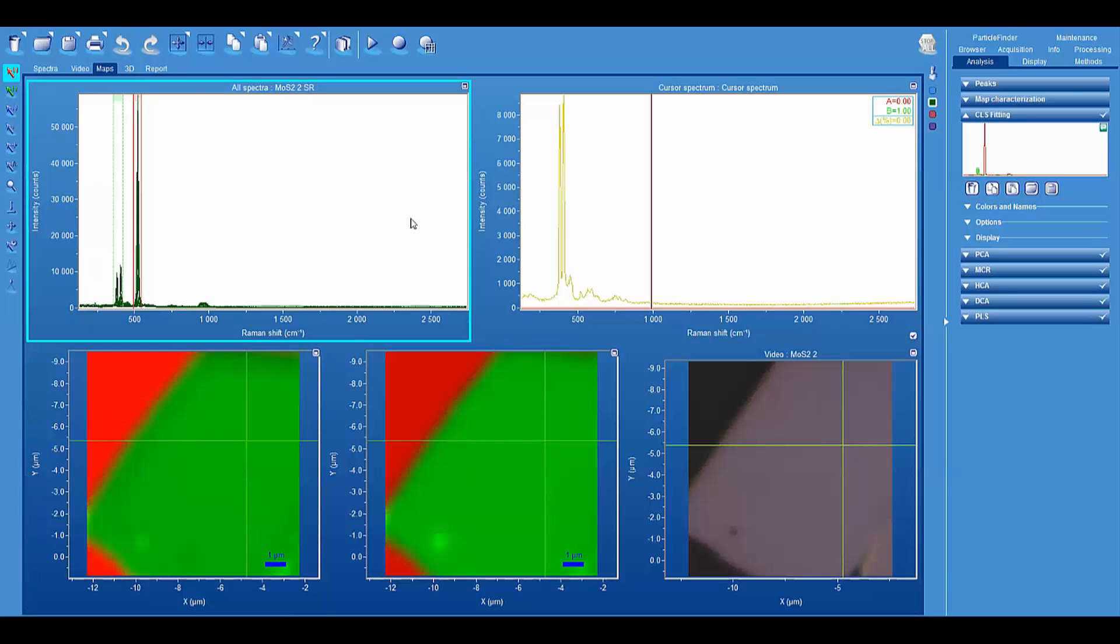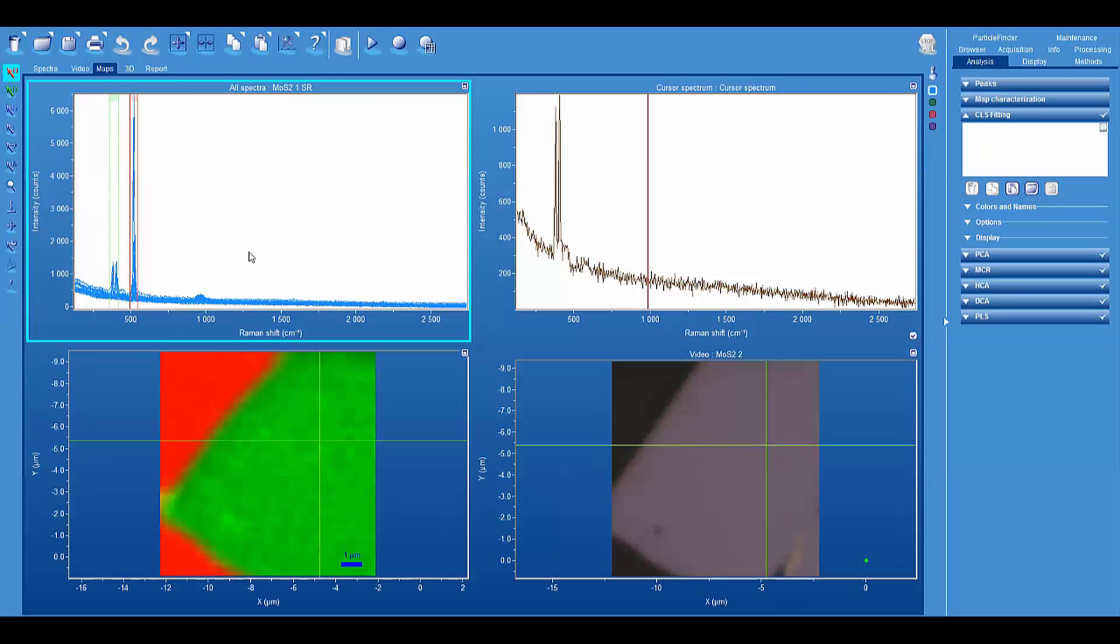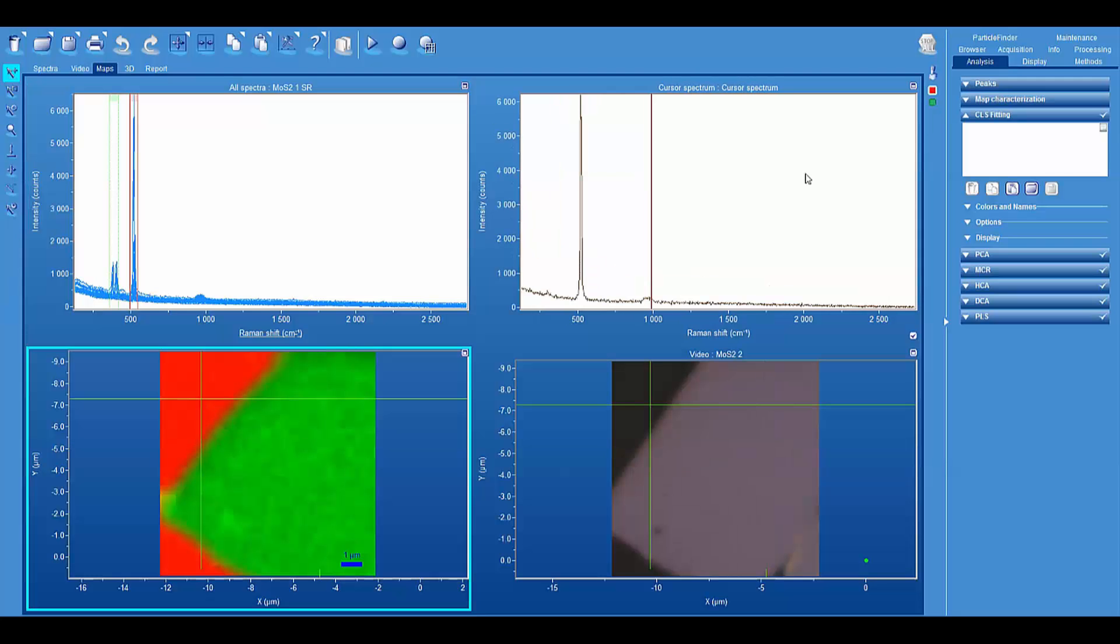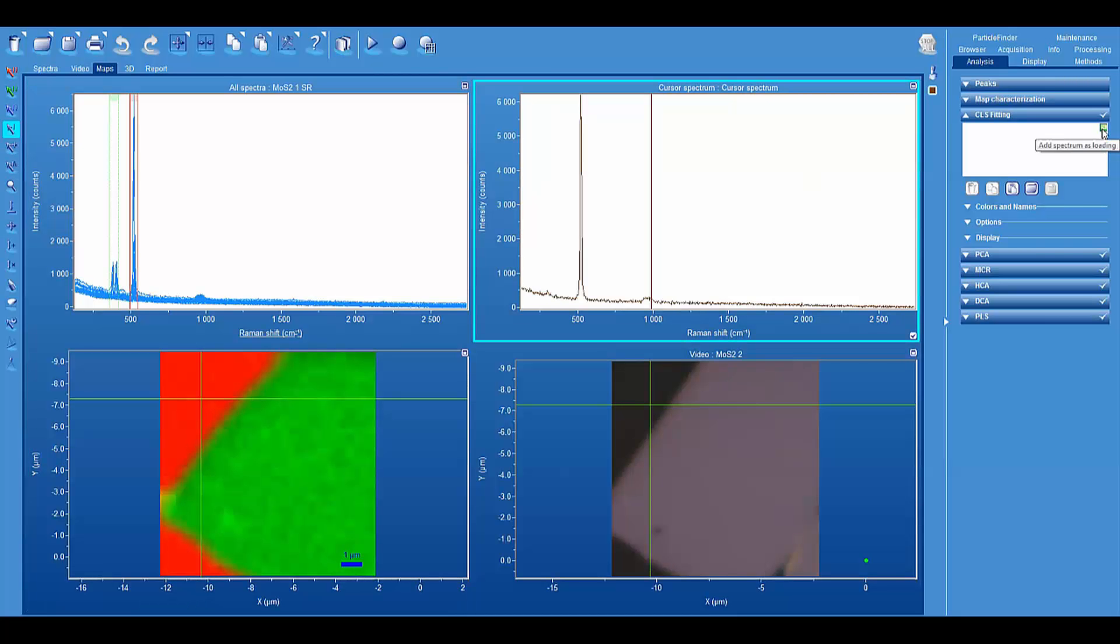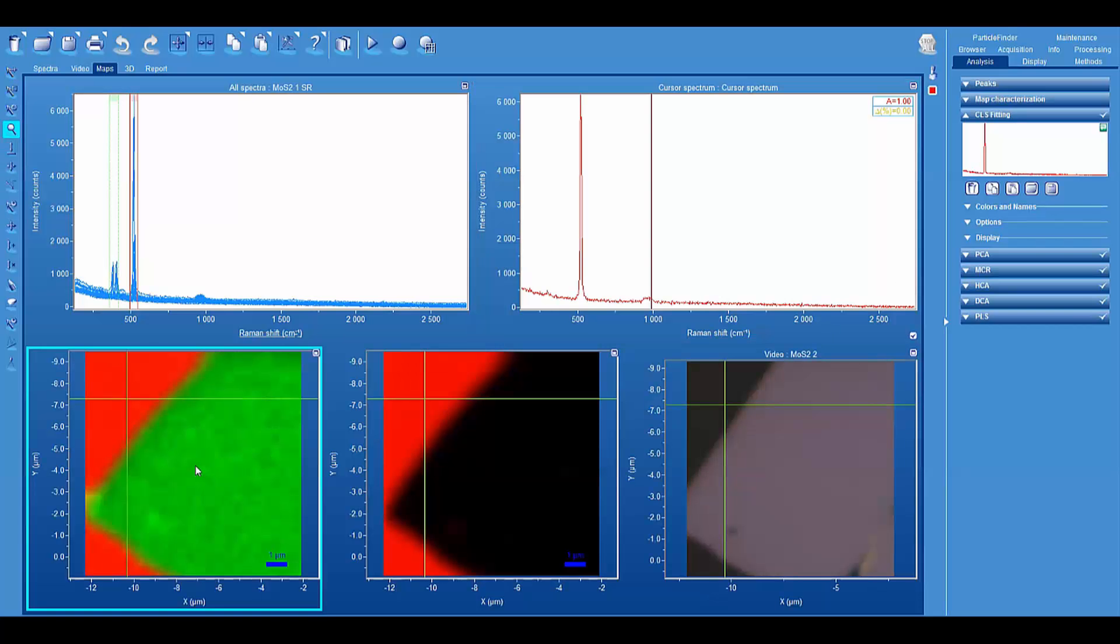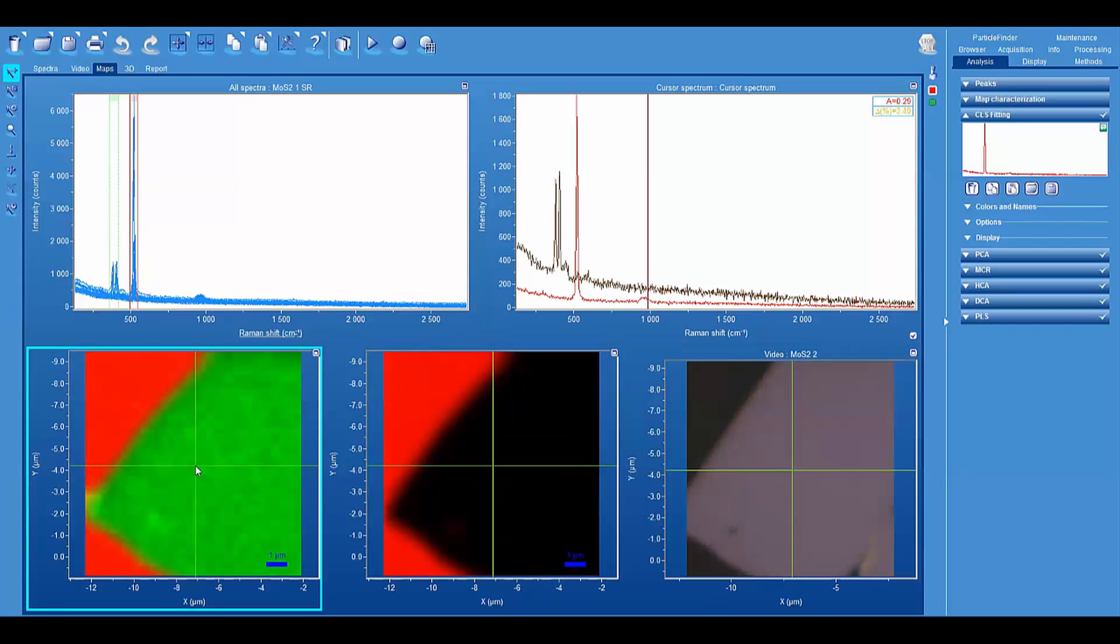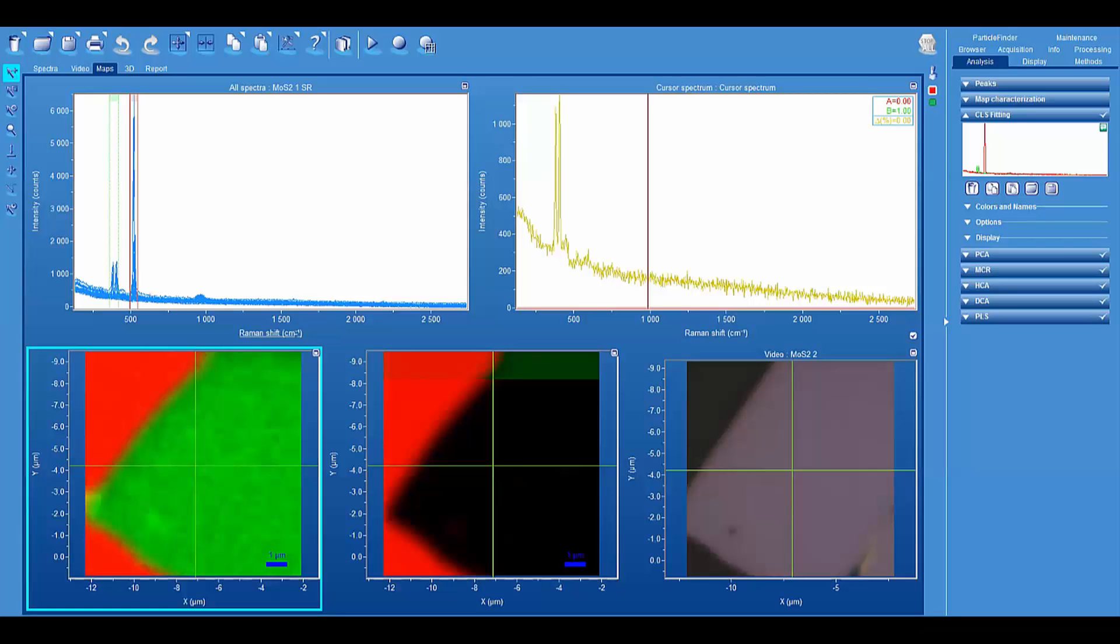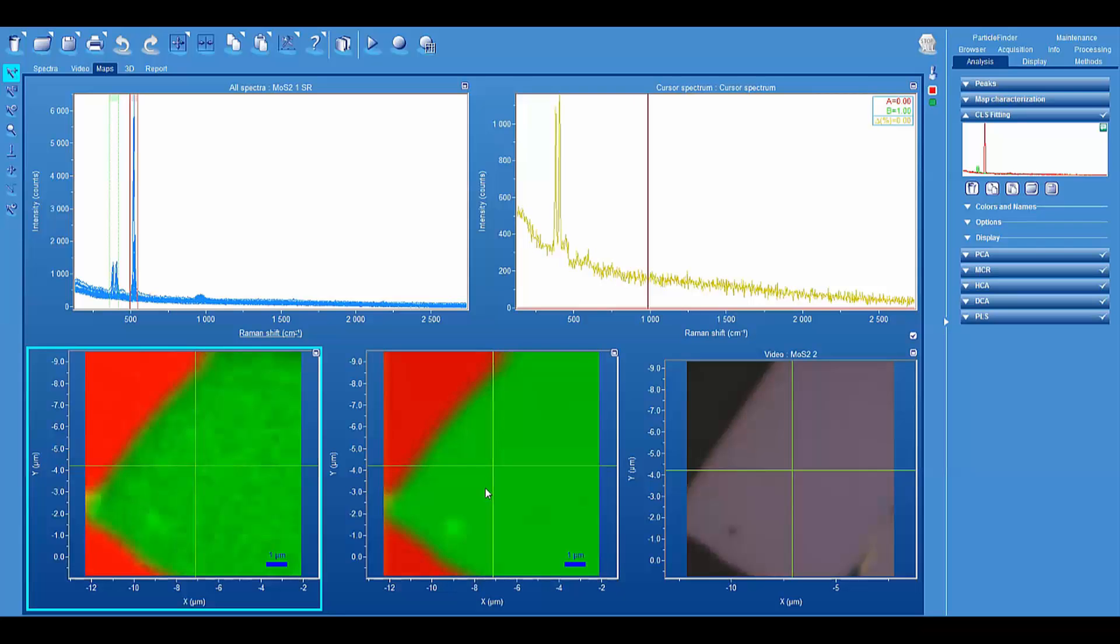Alright, so let's go back to our hyperspectral data set. This is for one second. Now let's look at the results from 100 millisecond integration time. And so let's run again our classical least squares. And we just enter that. Click on an area of molybdenum disulfide, enter that component, and there you see the image.